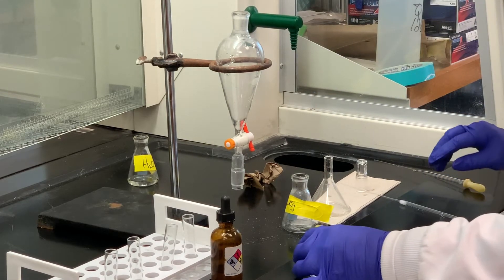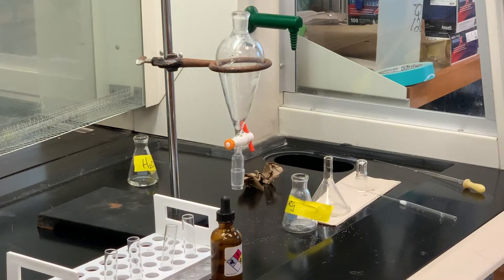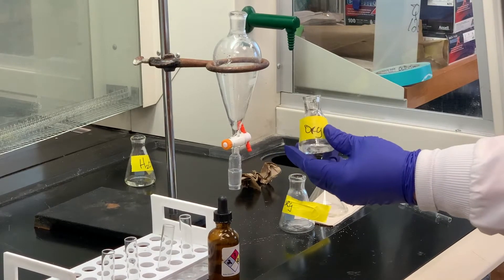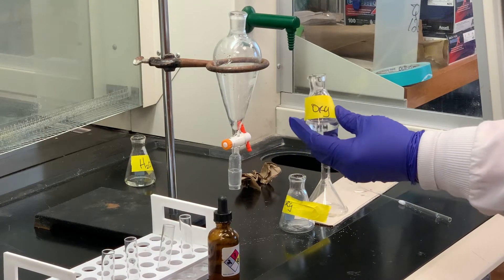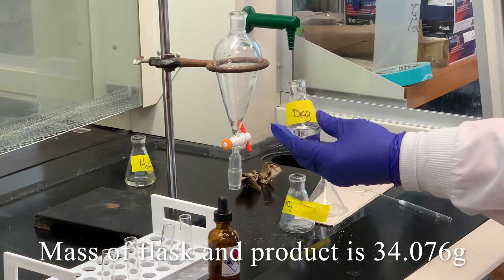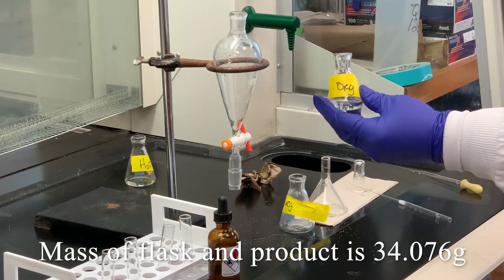I'm going to now weigh this and see how much we get. We weigh the flask containing the 2-chloro-2-methylbutane that we just made, and it weighed 34.760 grams.